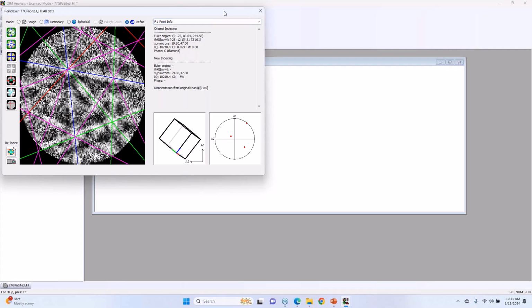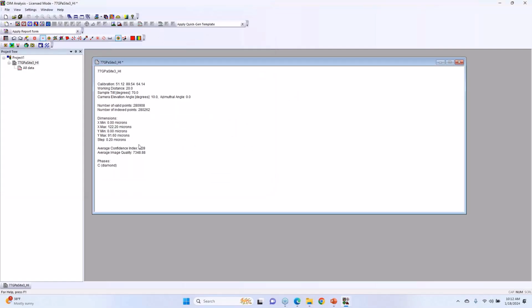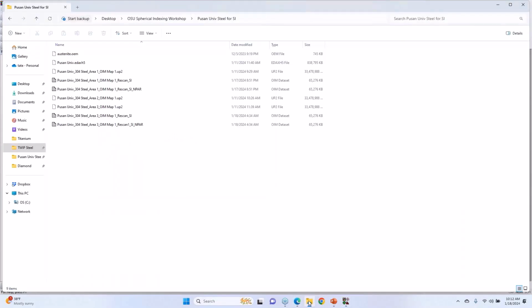Yes, H5 will be that, because that's the program that's output automatically by Apex. Those are already linked by name. It's basically looking at the name to figure out how to do it. So if you came here to your pattern and changed the name of your pattern file, then it would not be directly linked, because it's looking for the same file name between the two.